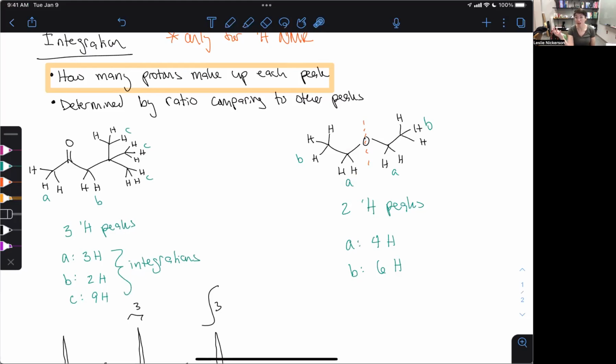It's just not possible to have 4 protons around 1 carbon and have it still be connected to another molecule. So when you're looking at that 4, I would always go towards the simplest route and say that's probably a 2 + 2 situation. So I probably have a CH2 and then another CH2 just like it somewhere else in the molecule. That's the kind of logic process that we want to go through.